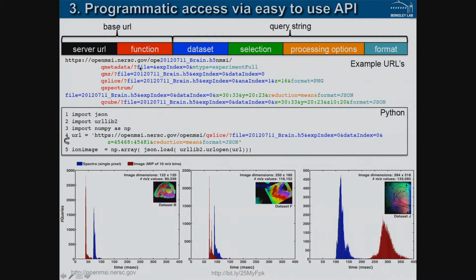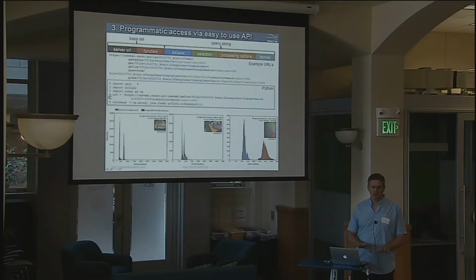So the API is very simple. We put a fair amount of thought into keeping things kind of minimal on the API. I think it's pretty good design where we have a rich parameter space for using the API, but a really small number of commands. Just these 5 commands are the only commands in the API. So it's pretty easy to document and teach people how to use the API. This is the web API, not the file API. There's an example of it.